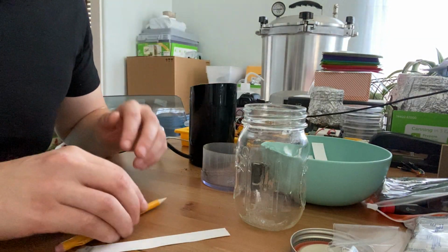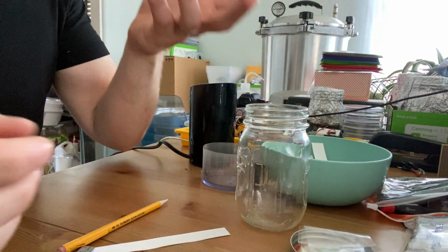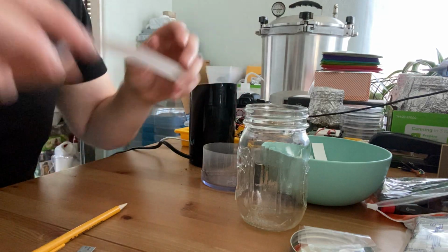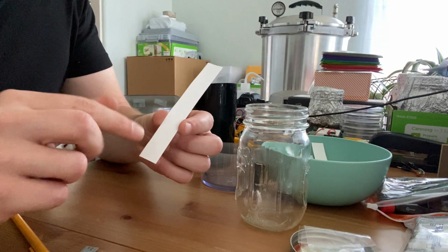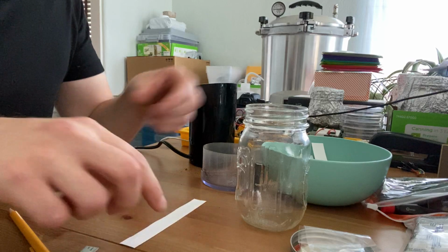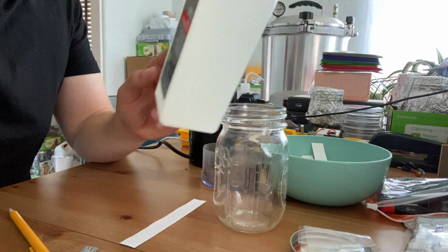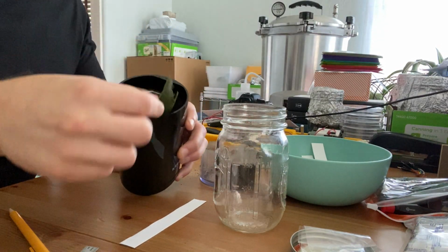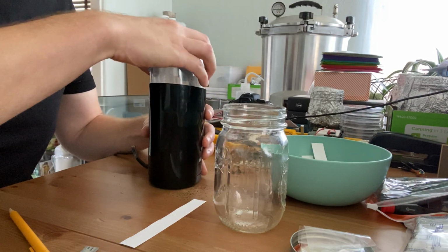So I'll tell you what I'm going to be using. I told you about the paper chromatography strips, pretty easy to get a hold of. I have a strip right here. And note that I try not to touch it too much because I don't want the oils from my fingers to be soaked in by the paper and interfere with the results of the tests. I have my developing chamber, which is just a mason jar, some acetone. I don't have a mortar and pestle. Instead, I've taken some leaves and I put them in a coffee grinder, and we'll go ahead and just give this another quick whirl right now.